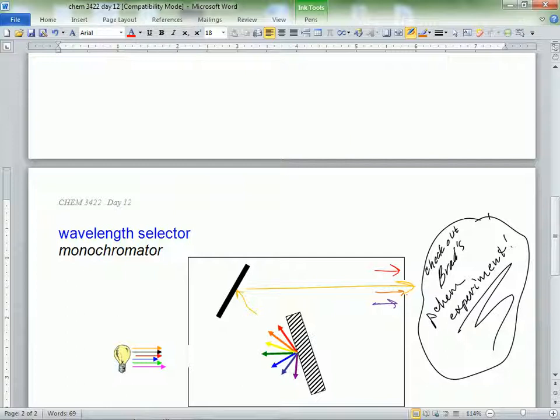And Bradley has played with slit width. In what lab? The Planck's constant. No, not that yet. Upstairs in 450. You had to actually type in the slit width. Oh, yes, when we were doing the atomic absorption. The AA, yeah. We had to practice with the various widths; the wider, the more wavelengths let out. So we could see more. Yeah, because the lamps are dying and we're having trouble. The more narrow we got, the less we could actually see. So you're playing with these slit widths.